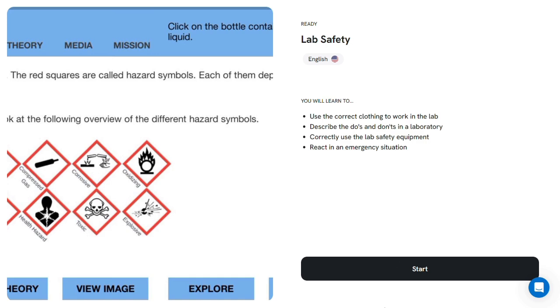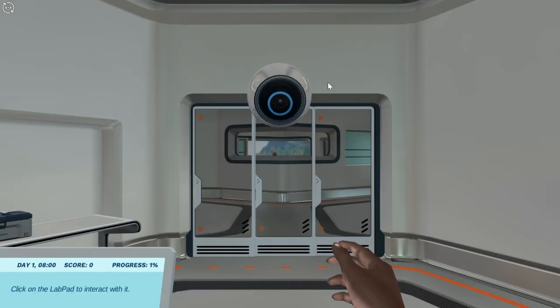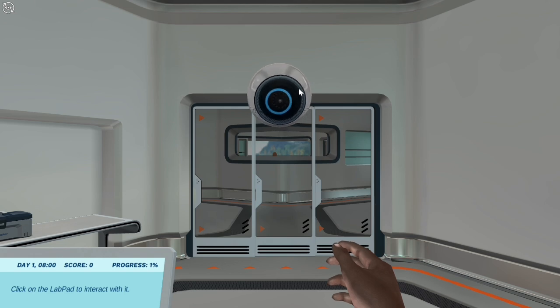With Labster, learners can experience the practical applications of science, enhance their understanding, and prepare for real-world laboratory work. Today you will learn everything you need to know to survive your first day in the lab. Are you ready for the challenge?